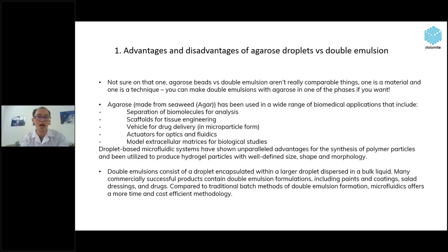Actually, agarose is made from agar or seaweed, so it has been used for a wide range of biomedical applications. That includes the separation of biomolecules for analysis, or scaffolds for tissue engineering, or vehicles for drug delivery. It also can be used in actuators for optics, fluidics and motors, and as extracellular matrix for biological study. So the droplet-based microfluidic system has unparalleled advantages for synthesizing polymer particles, and it has been utilized to produce hydrogel particles with well-defined size, shape and morphologies.